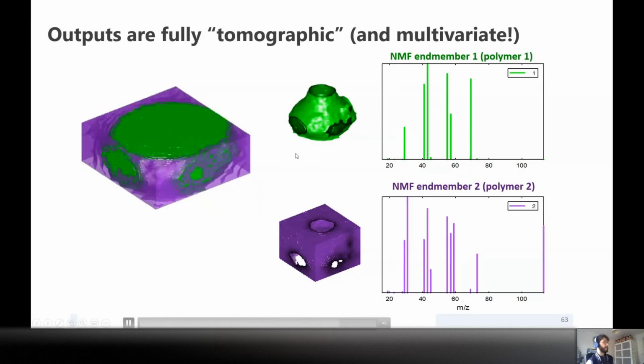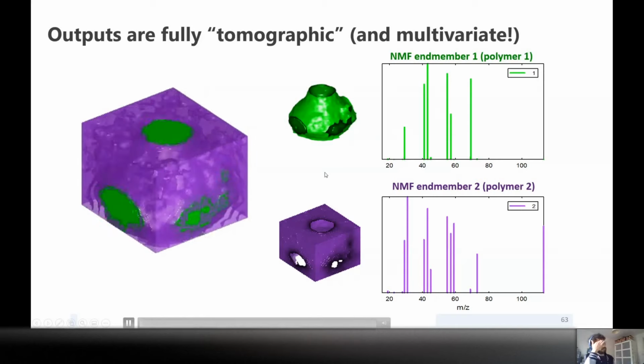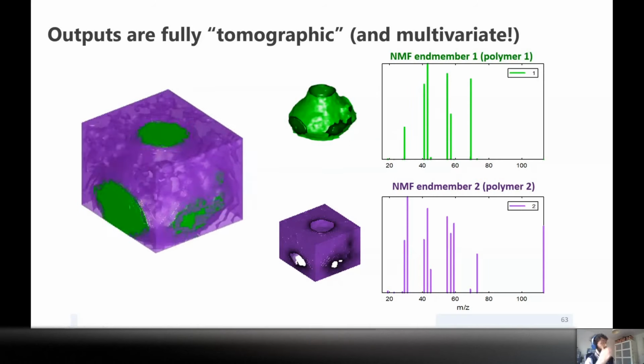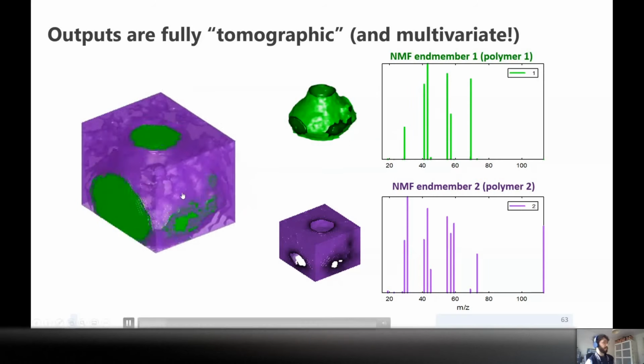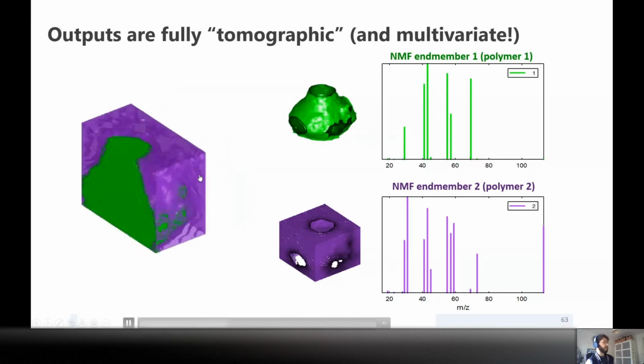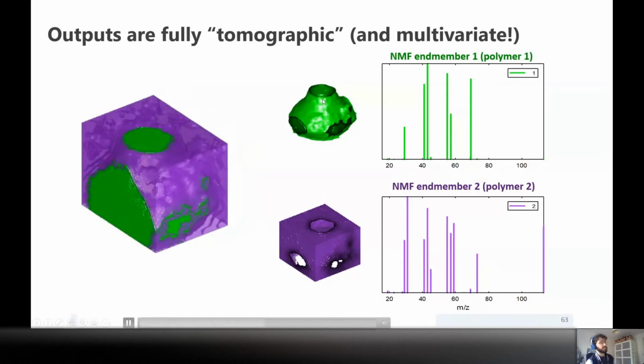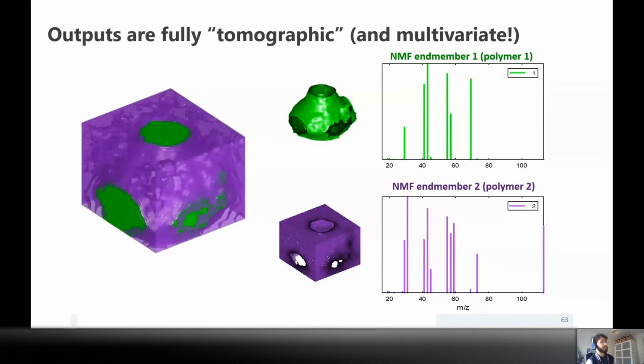So it's quite useful. And again, here I'm doing an overlay, but the 3D version of an overlay, right? I'm assigning a color for each. The transparency is arbitrary here, just more for the purple. But each of them has colors, and the way to define where you will draw the figure is based on an intensity that you set. And then we can do these isosurfaces.